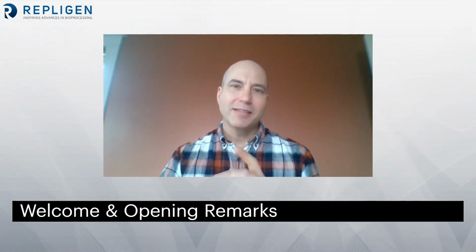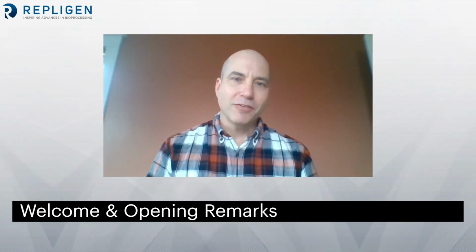Today, we're going to stay around the chromatography unit operation and introduce an inline analytical technology that can be applied to the chromatography step, but also be applied to other downstream unit operations such as TFF and formulations, right? Today's speaker, Ramzi Shambaki, Director of Bioprocess Applications, has been an integral member of both the internal technology development team as well as directly working with customers in the field on developing applications.